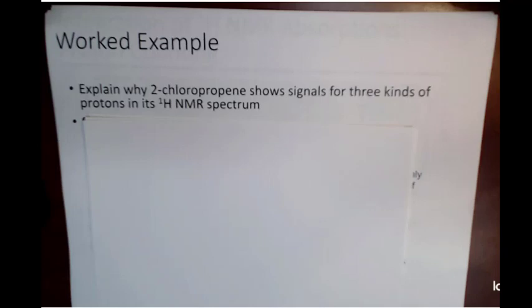Alright, we are back. This is going to be chapter 13, and this will be our second video in the installment for NMR spectroscopy. Alright, kind of looking at a worked example problem here. Lastly, on our last video, a large portion of the end of the video, we talked a lot about how the environment can affect where our peaks would be.